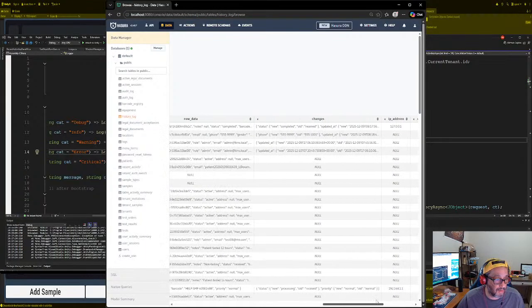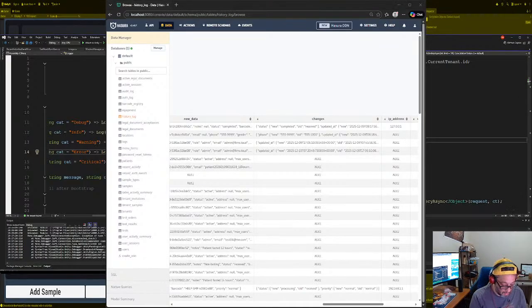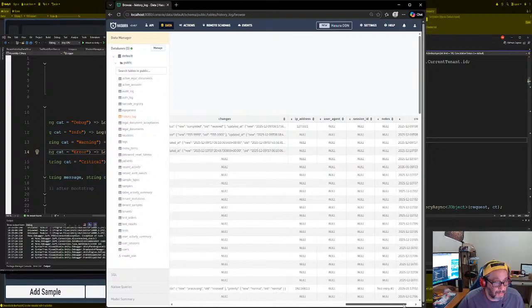No, we don't have changes. I'm gonna change operation to changes. That's the history log, right? History log, yes. Do we have a record ID?